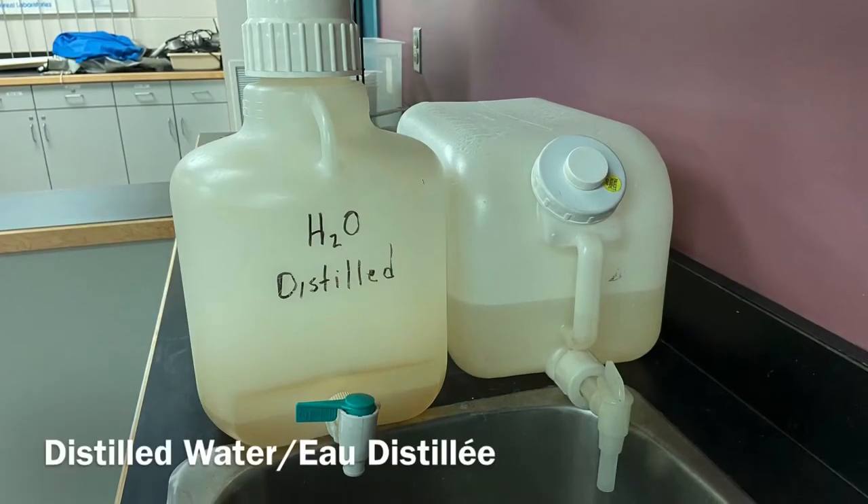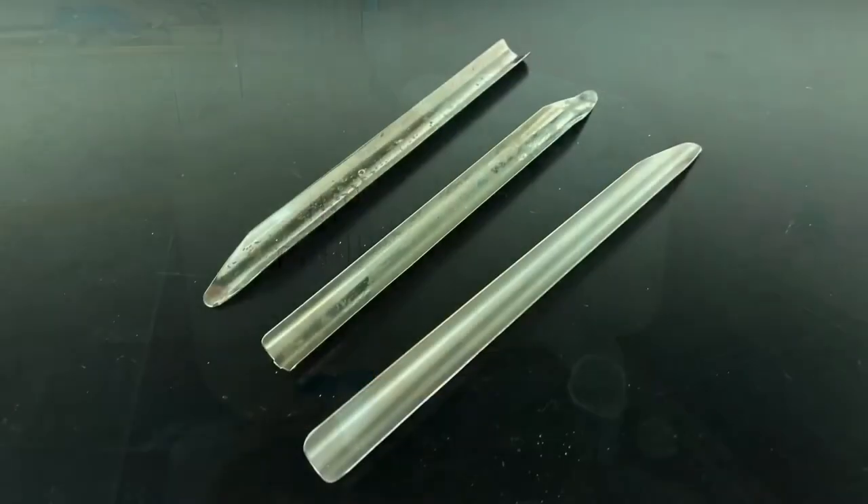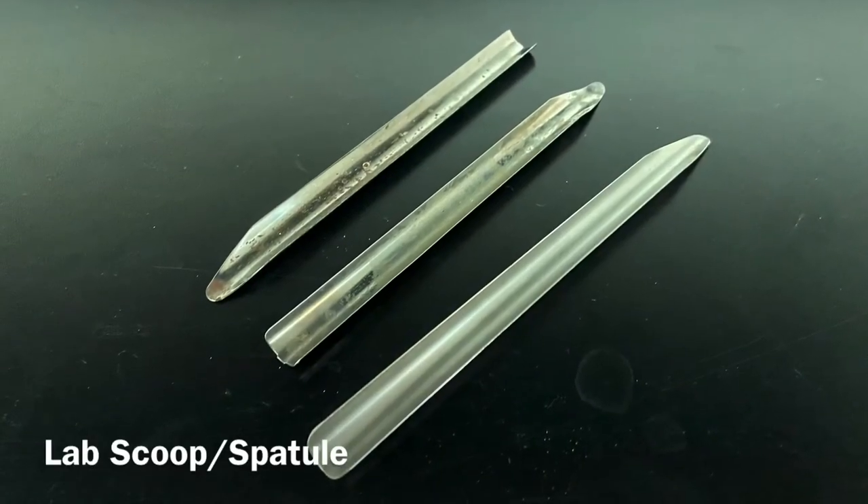Distilled water. Eau distillée. Lab scoop. Spatule.